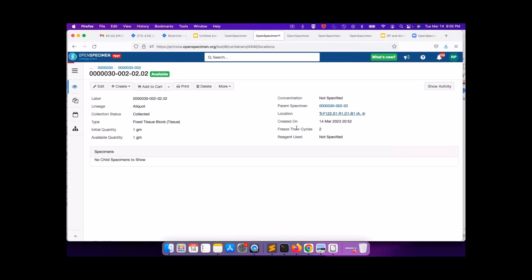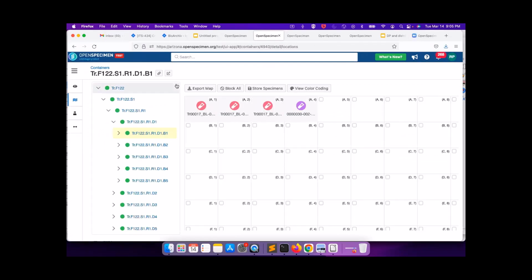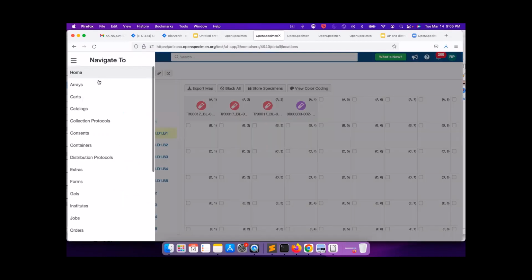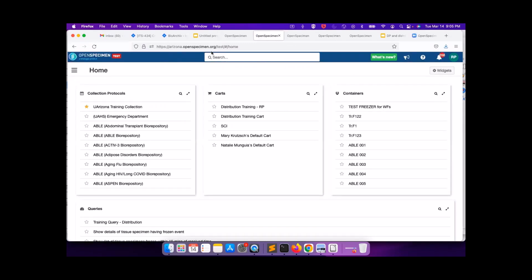Now, I think I missed one another case where you temporarily store specimens inside a box. You set it aside, and then ultimately you send that to researchers or PI of the protocol. I think that was coming from Brandon. So let us assume for a week's time you are storing all your serums within one particular box. You know that particular box name.